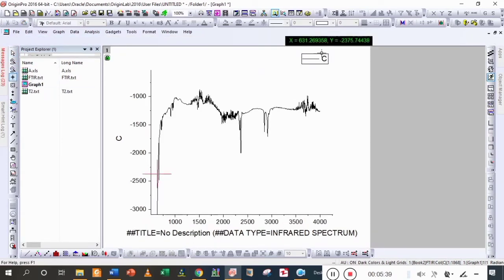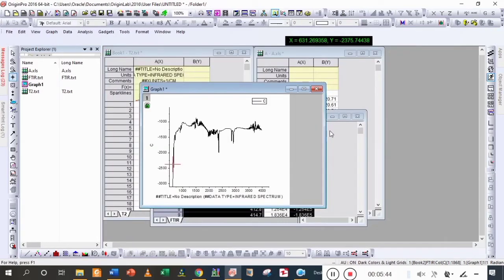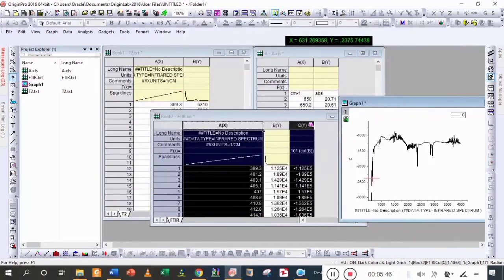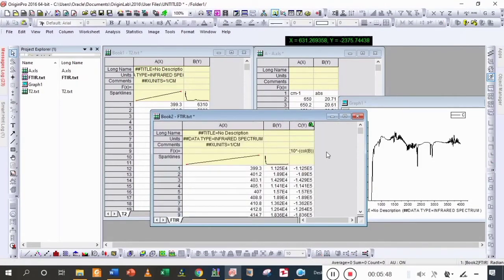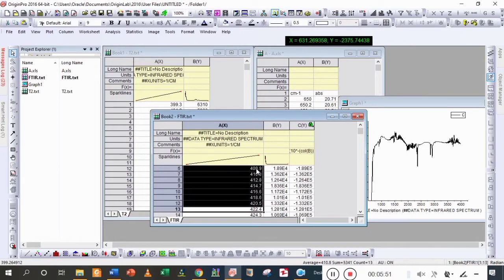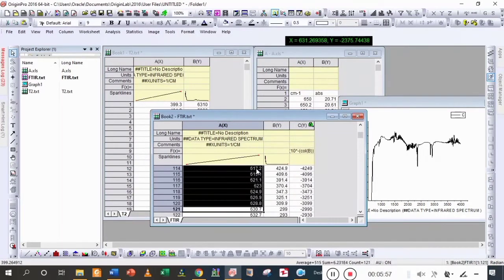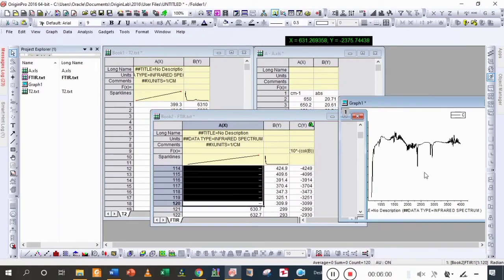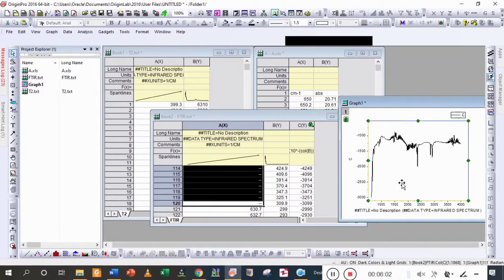Select the point where you want to remove it — it is at 631 — so we are going to remove it from the book. As I press the delete button, you can see that the data point is deleted.